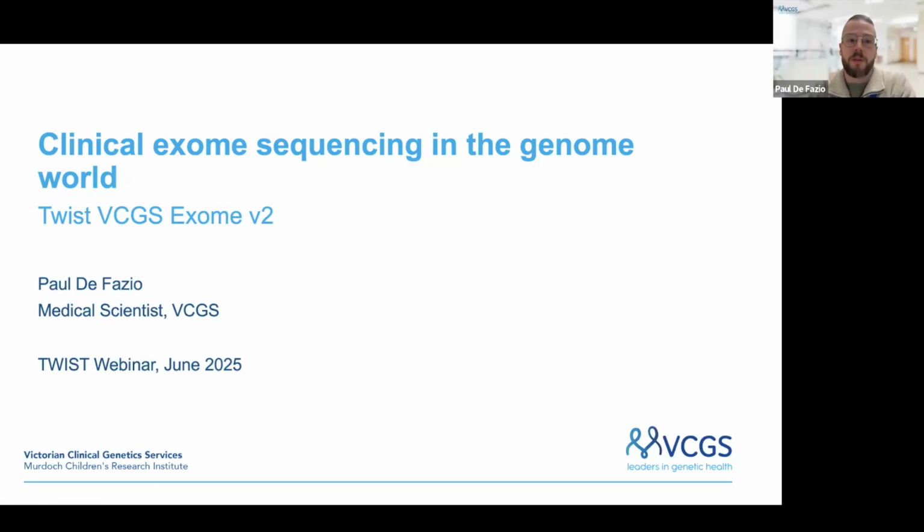The title of my talk is The Role of Clinical Exome Sequencing in the Genome World. And I'll be talking a little bit about our experiences using the Twist exome, and specifically some customizations we've done to the Twist exome to better close the gap with whole genome sequencing, and a bit of a discussion about why we've done that, and what advantages that provides us in our setting here.